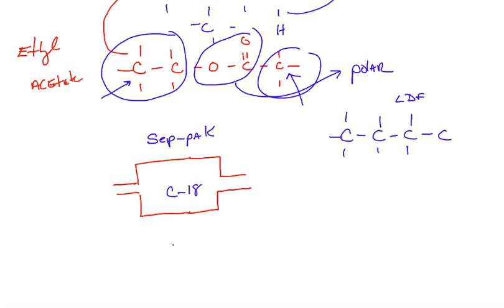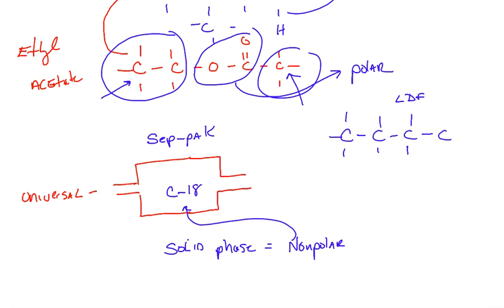So in this case, our solid phase is predominantly going to be nonpolar. Okay? And we're going to eventually push our universal indicator through the Sep-Pak.